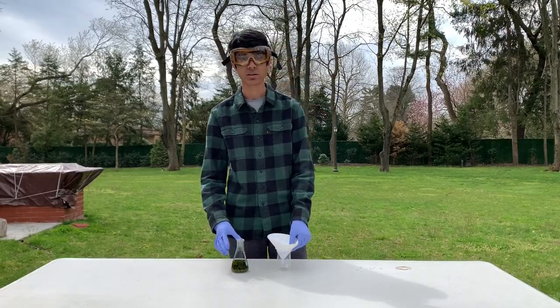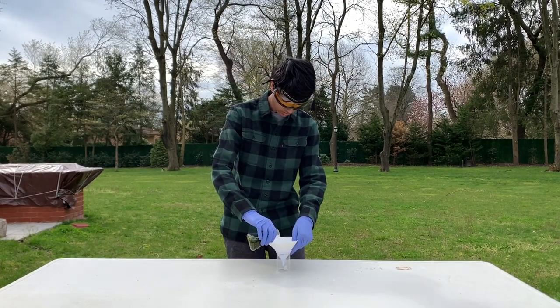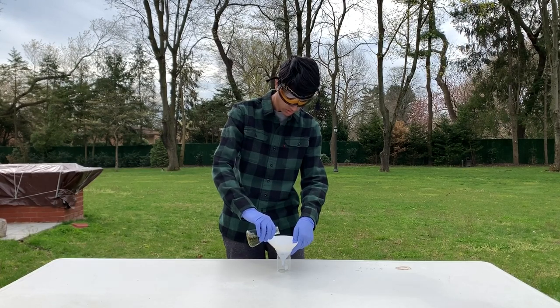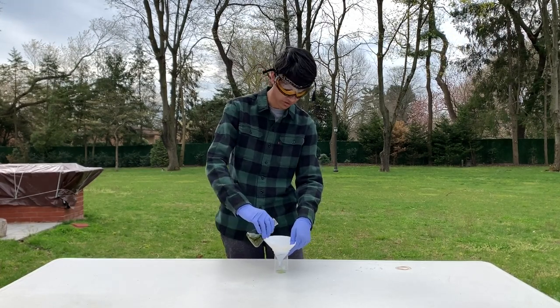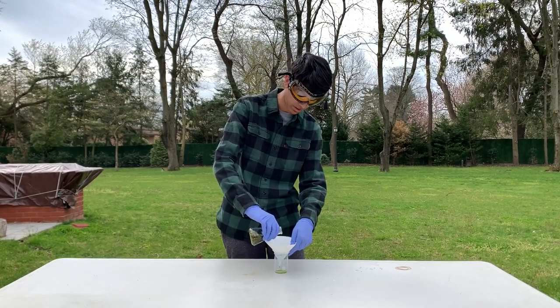Now we're going to filter out any of the peppers that didn't dissolve. We're going to do that by running it through some filter paper, and at the end we're going to have a solution of just capsaicin and methanol.